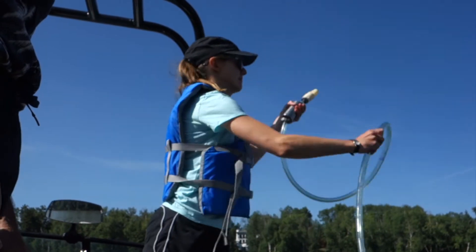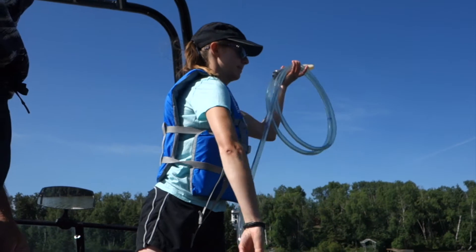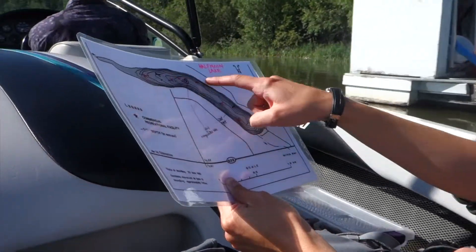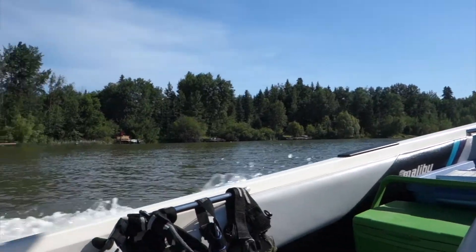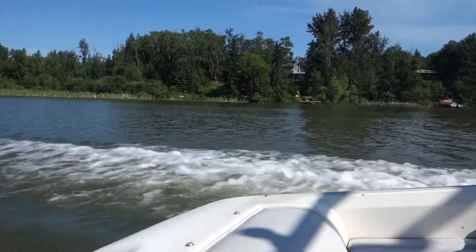Welcome to LakeWatch. This video will introduce the sampling protocol for collecting water from across the lake. In order to create a full composite sample of the lake, we will need a total of 10 different sites on the lake where water needs to be sampled. As a volunteer, you will be taking the OMS technician around to these 10 sites while they collect water using a one-way valve and tubing.